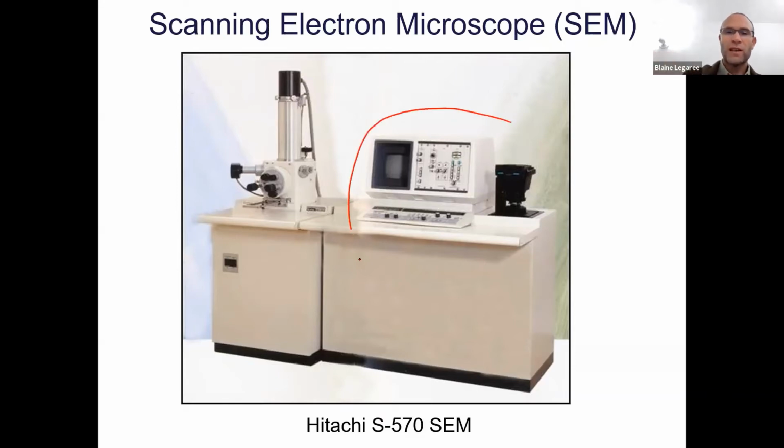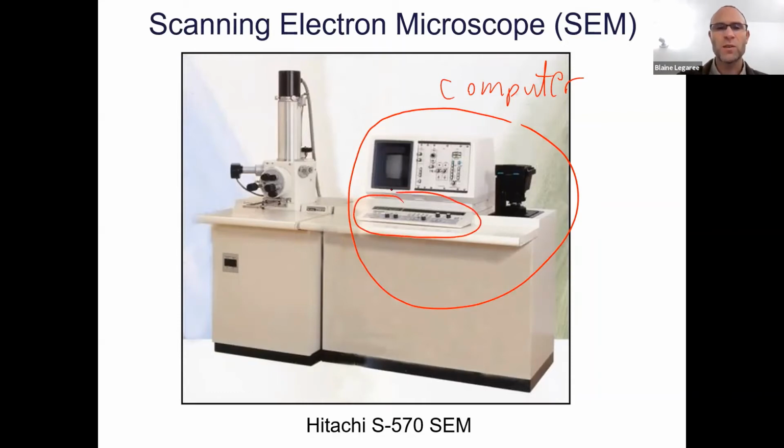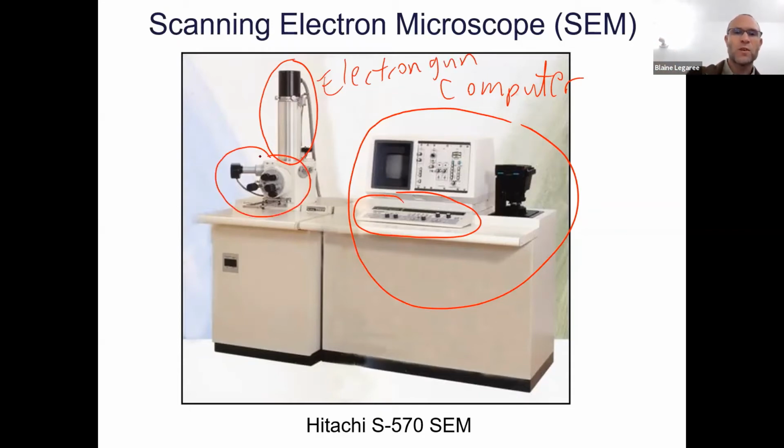So what you're looking at right here, this is actually an old computer. What's not shown here is there's actually a desktop computer sitting on the right of this that's hooked up to this microscope. I still use these knobs here. There's some knobs for focusing and whatnot, and I think there's an on button there or something like that. But most of that wasn't actually being used. So this here is the electron microscope. This thing here, this is the electron gun, we'll call it. Down here is the sample chamber. So that's actually a vacuum chamber. And so I'll show you how the technique works.